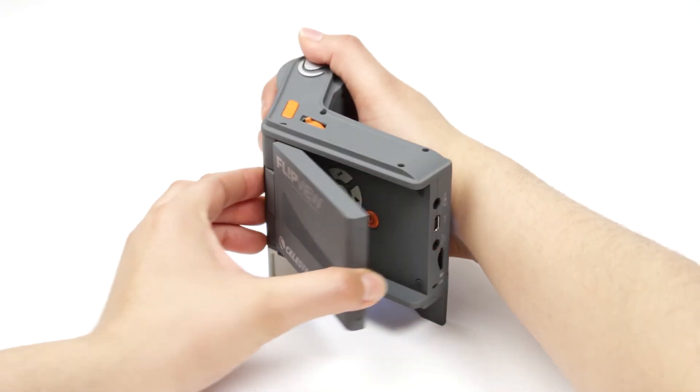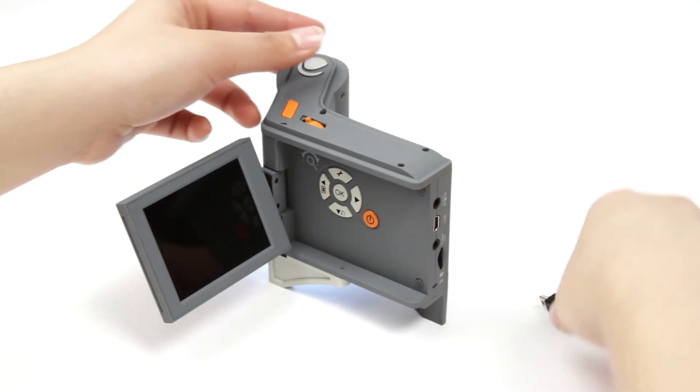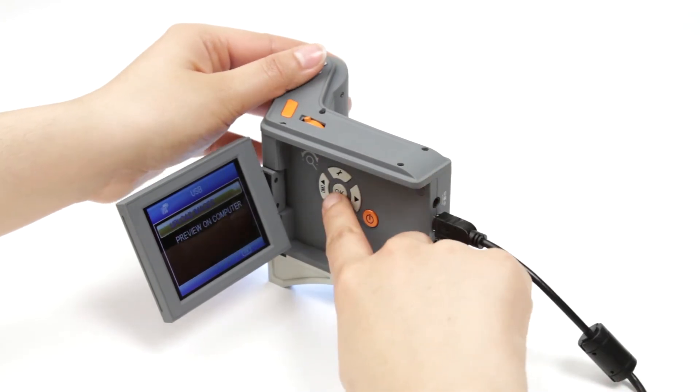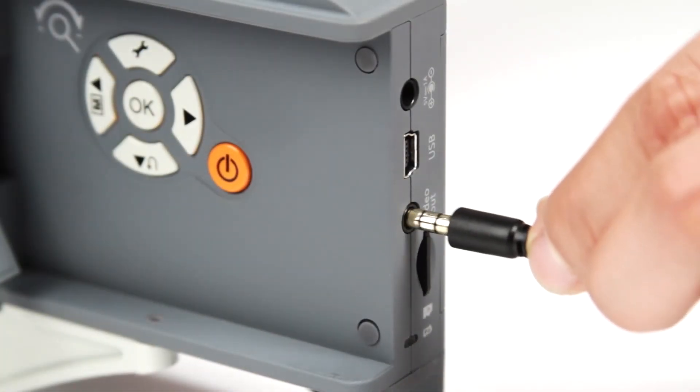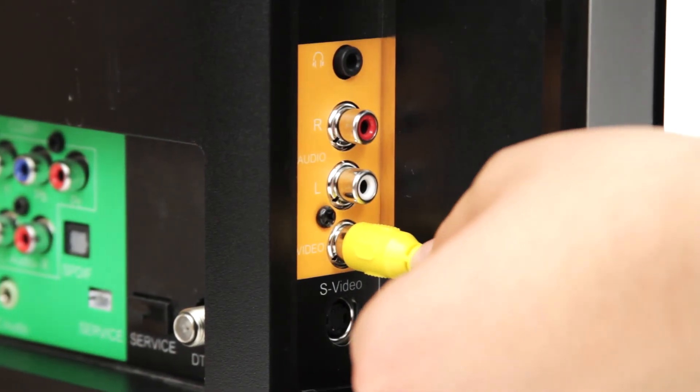When you return to the lab, use the included USB cable to transfer your images to your PC, or install the included Mac or Windows compatible software to extend your viewing experience. You can also use the included video-out cable to stream your images to a projector or large television monitor.